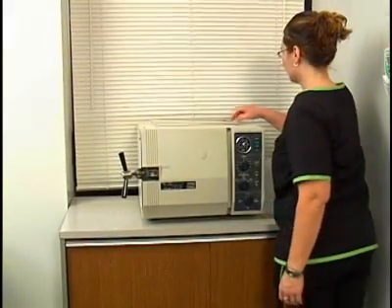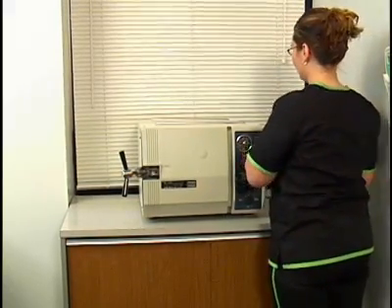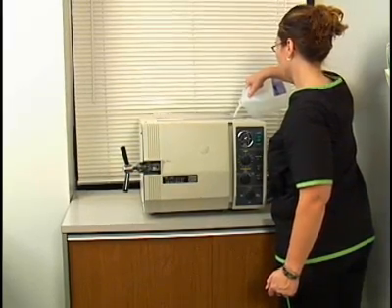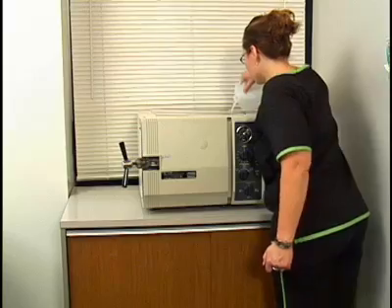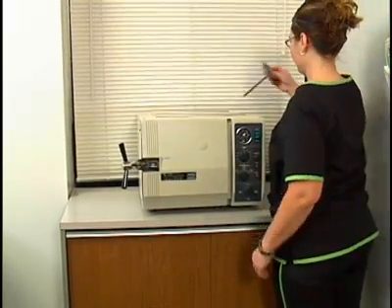Check the level of water in the autoclave. Water contained in the water reservoir of the autoclave is converted to steam during the sterilization process. Add distilled water if needed. Distilled water prevents corrosion of the stainless steel chamber of the autoclave.